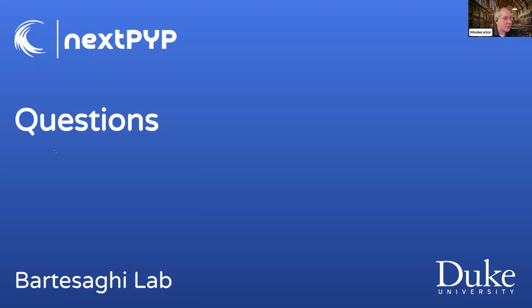Okay, so we should probably do maybe 1 or 2 more questions. There's one here. It says CTFFIND5 seems to work better for tomography. Can you please try to integrate that into nextPYP? We can definitely look into it, and we appreciate suggestions.